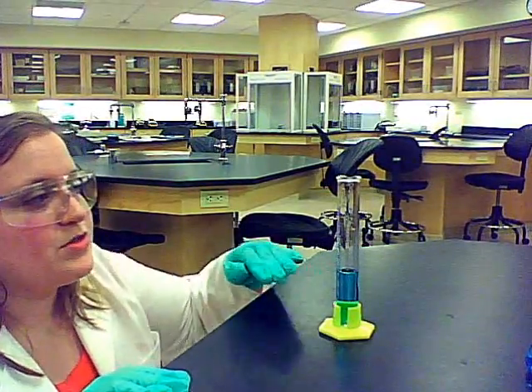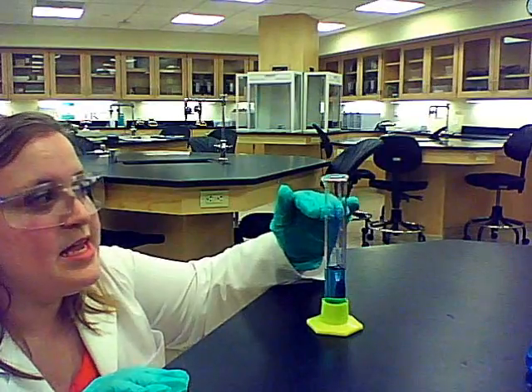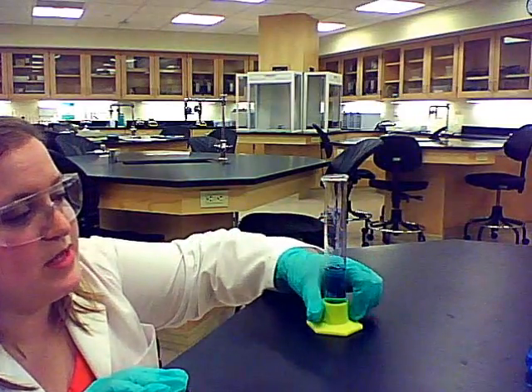This graduated cylinder happens to have a tick mark for every single milliliter, and it goes up to 50 milliliters, so you can never measure more than actually is in the graduated cylinder. Even though you can fit more than 50 milliliters, you'll never know what the actual volume is if you go over the measured lines.